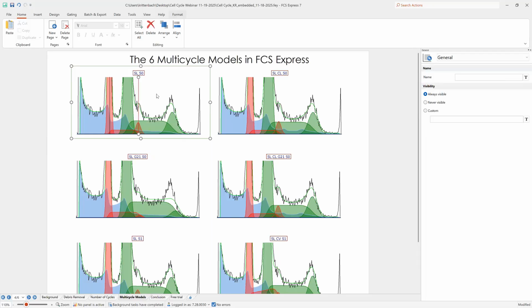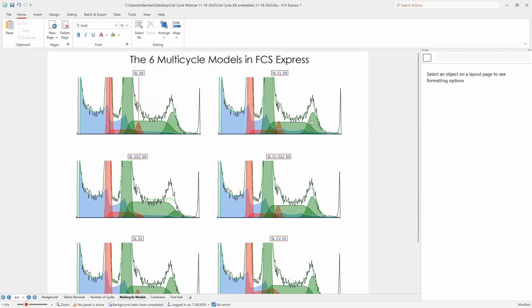But if auto fit is disabled, you may have the freedom to move it from side to side in order to tell the algorithm where a particular peak is visually. If you're able to see the peak and you want to tell the algorithm that the center point of my peak is at this certain point, you can disable autofit and grab that position marker to move it from side to side. And that can better help the algorithm to fit your data.